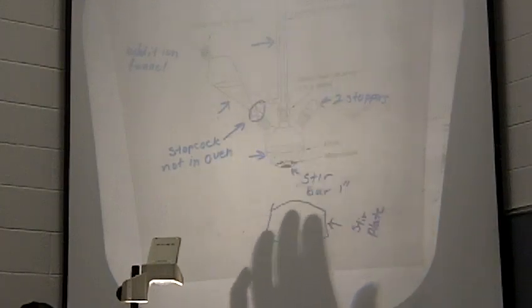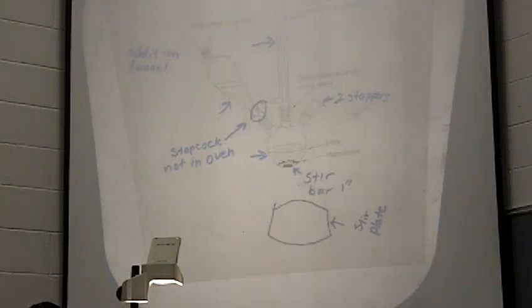And we're going to set this up so you're going to have separation between the bottom of your round bottom flask and the top of your stir plate, because you're going to use your hands to get the reaction going, to start heating it, okay? So remember, it doesn't take a whole lot to boil ether. What's the boiling point of ether? 33, 34 degrees, so it doesn't take a whole lot.